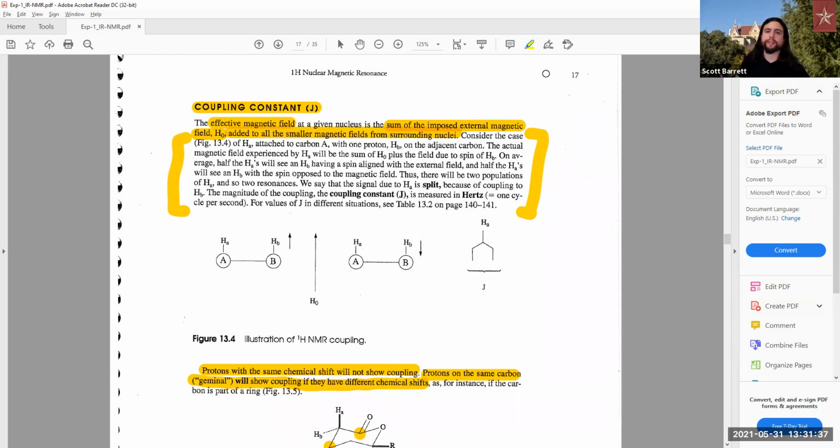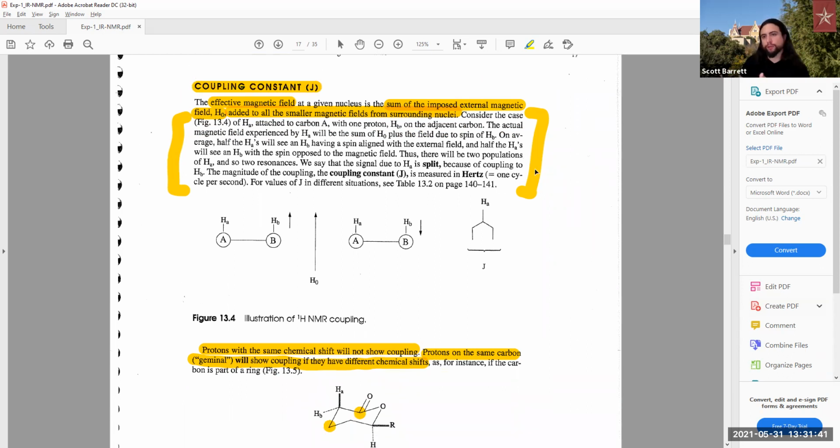So the coupling constant is a little bit more advanced. You can memorize some of these very well for certain specific functional groups, but it is better for the larger functional groups, so that you can look at that. The smaller ones can get kind of intertwined.